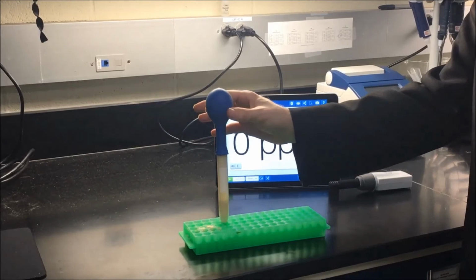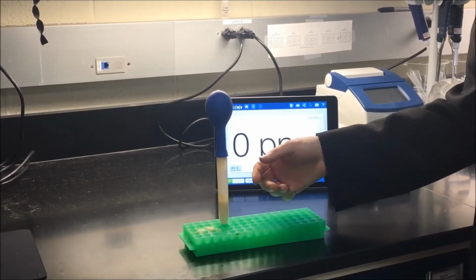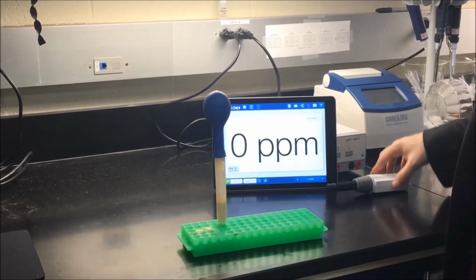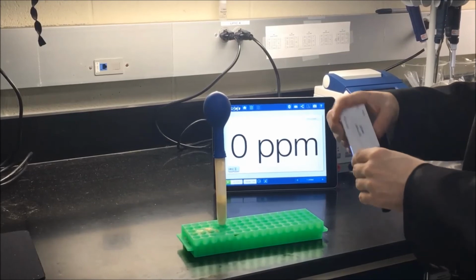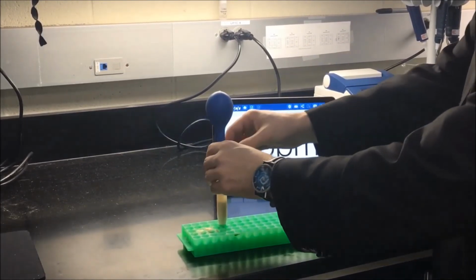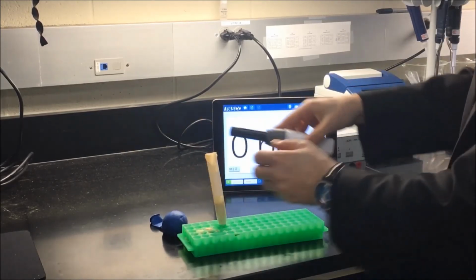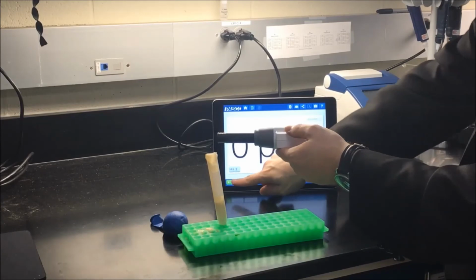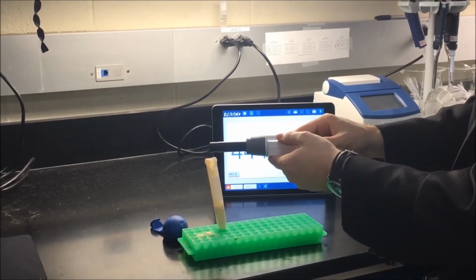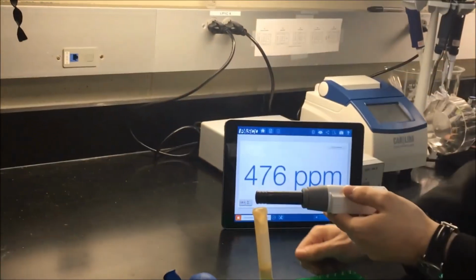And you can see the balloon has begun to expand because through the process of respiration, carbon dioxide is being produced. And I can verify that it is carbon dioxide by using a carbon dioxide sensor here. So I will remove the balloon, hold my sensor over the tube, and then when I press play, you can see that it is detecting carbon dioxide being released from my yeast culture.